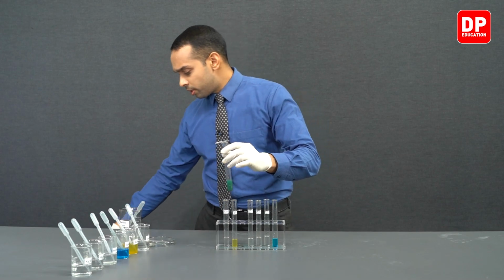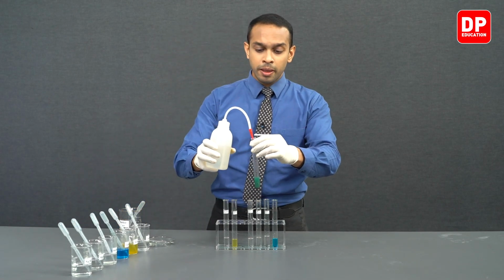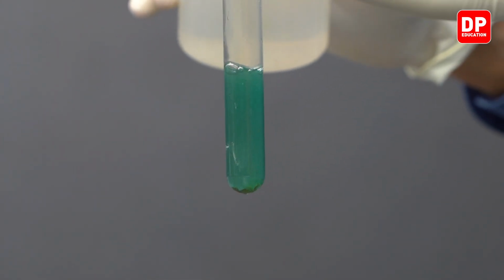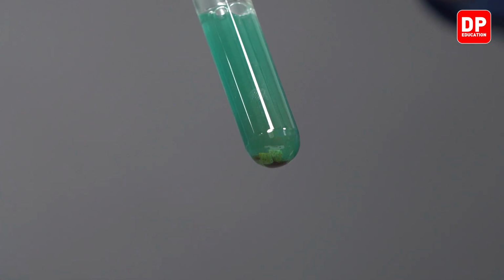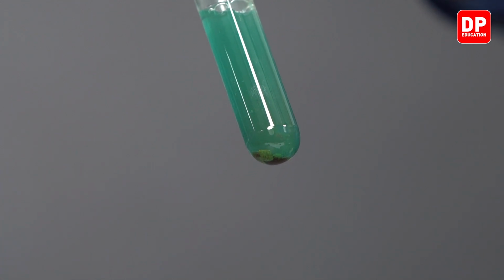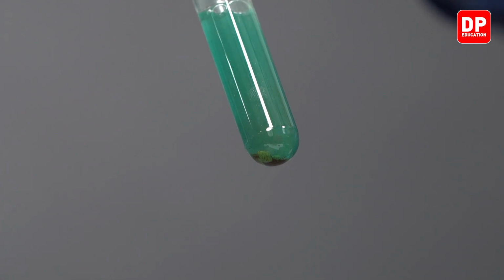If you want to observe this precipitate a little bit, you can add a little bit of water. You can see as we add water, the copper metal that is present at the bottom as a brown color precipitate gets dispersed a little bit, and you can observe the copper solid particles over here very clearly.